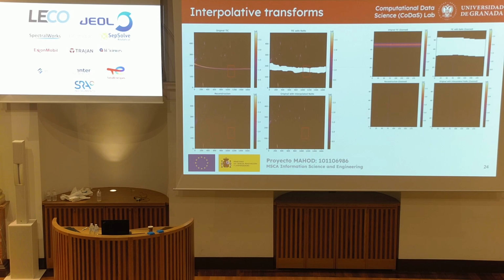Using the power of Bob Ross, I zeroed out this column bleed section, and I thought, why not interpolate the column bleed section? What if I wanted to quantify, oh man, you can't see it, I'm so sorry, folks. But there's this bleeding, this tailing peak, right? So it intersects with the column bleed, we get rid of the column bleed, we do the interpolative transform, now we can integrate the peak in the absence of the column bleed. I think that's kind of cool. Maybe it's an edge case or whatever, but I like it.